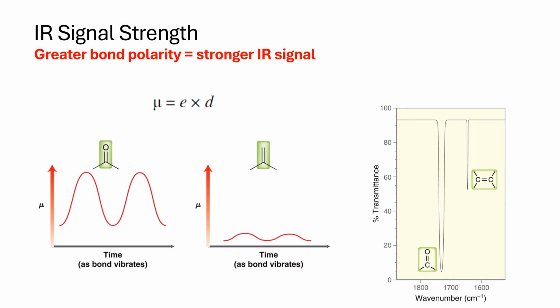Here, this is what I was mentioning about bands and related intensity with dipole moment. And the greater dipole here is what explains why the carbonyl band is so much more intense. And remember, in regard to intensity, that this graph has 100% transmittance above and 0 transmittance below. So the light that is transmitted, meaning 0 transmitting is 100% absorption. So this is what we call absorption bands, because essentially all of that is absorbed. Notice it's close to the 0 here. And again, this is not as polar, so not as strong.